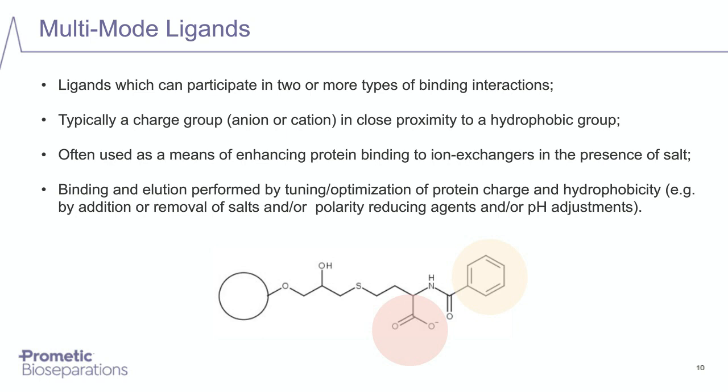That led to the idea that, rather than choosing a single ligand and adjusting the conditions to suit that ligand, why not take the protein solution that we need to purify, and find a multi-mode ligand that is optimal for that particular protein in that particular mixture. So it's a very different way of looking at multi-mode ligand chromatography.